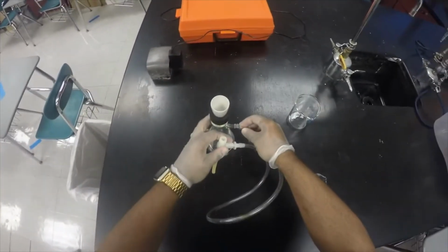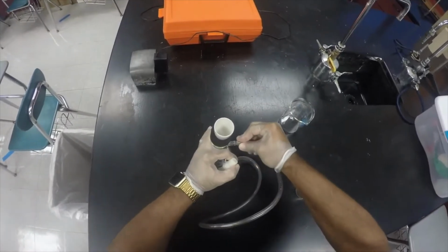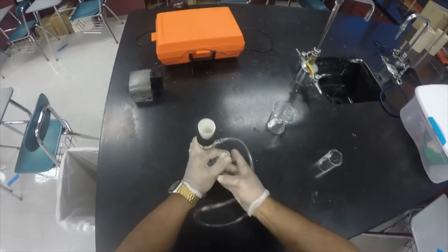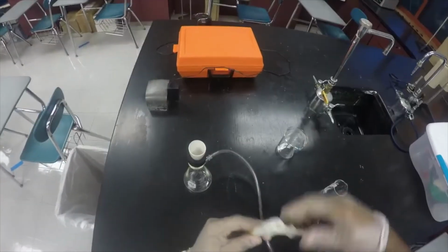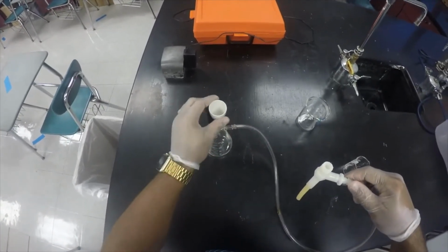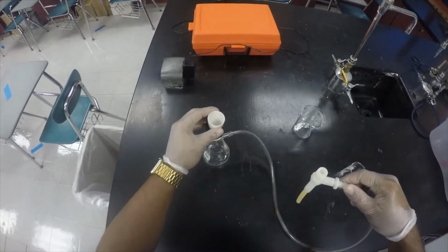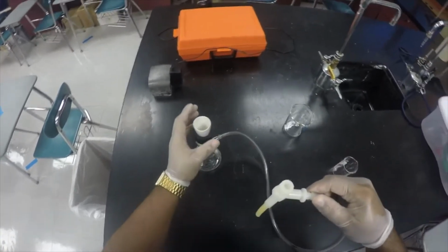The aspirator fits into the filter flask like so. And when I connect the aspirator to the sink, it creates a vacuum that pulls the liquid through the Gooch crucible and allows the material to be filtered through, again, vacuum filtration.